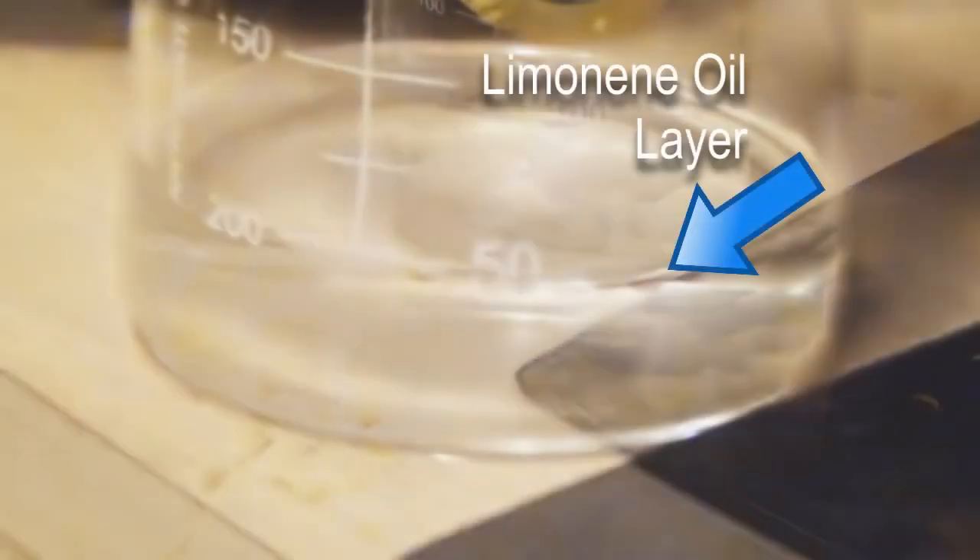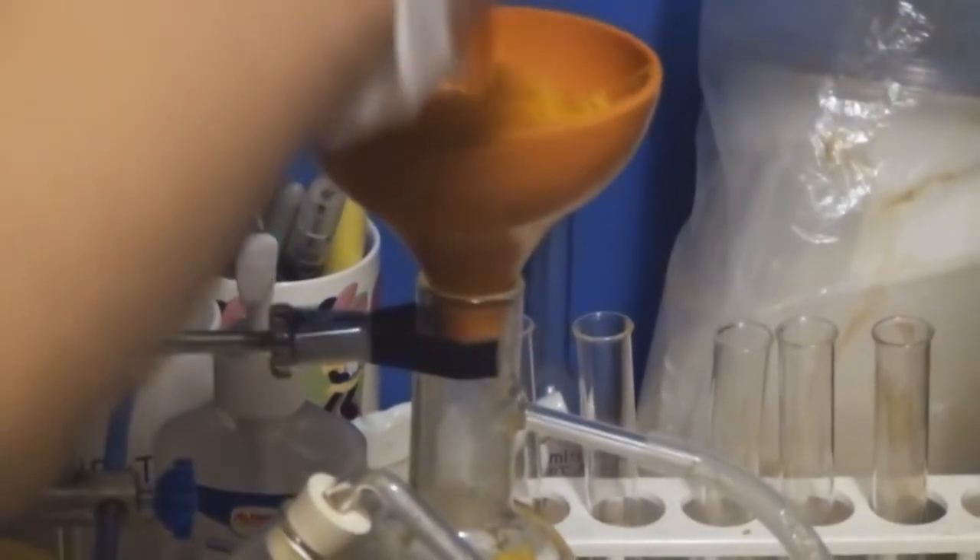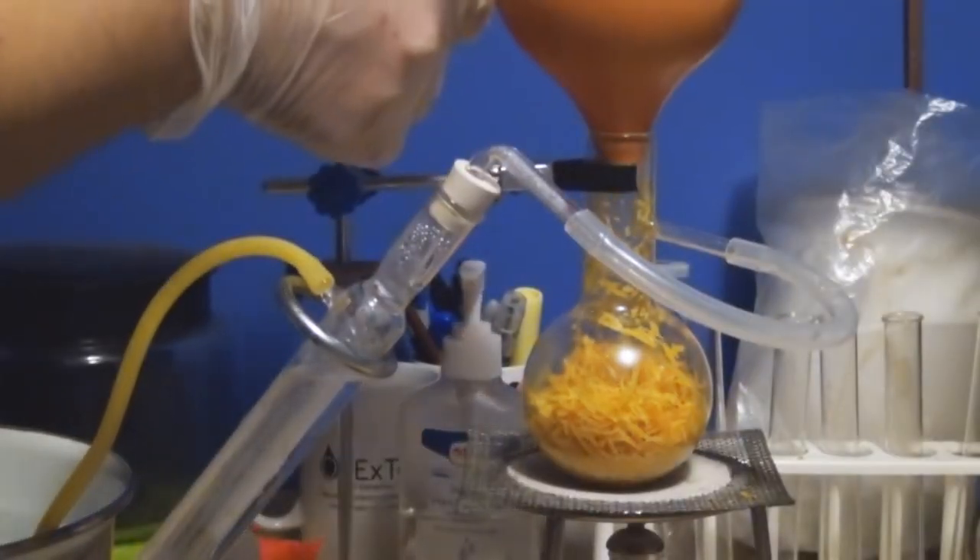Before you start your second run, you want to make sure to clean your apparatus. We're going to go through everything again and allow the distillation to continue for another hour or so.